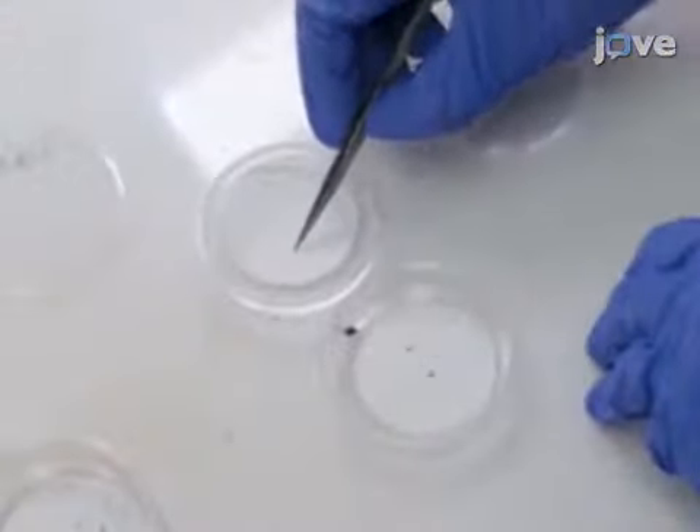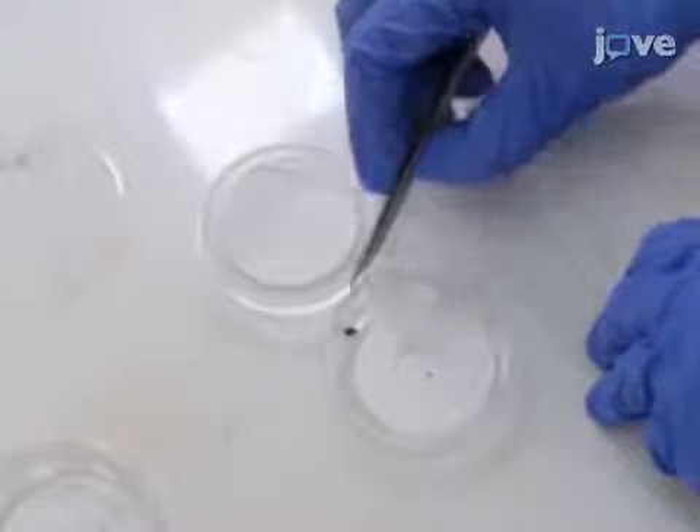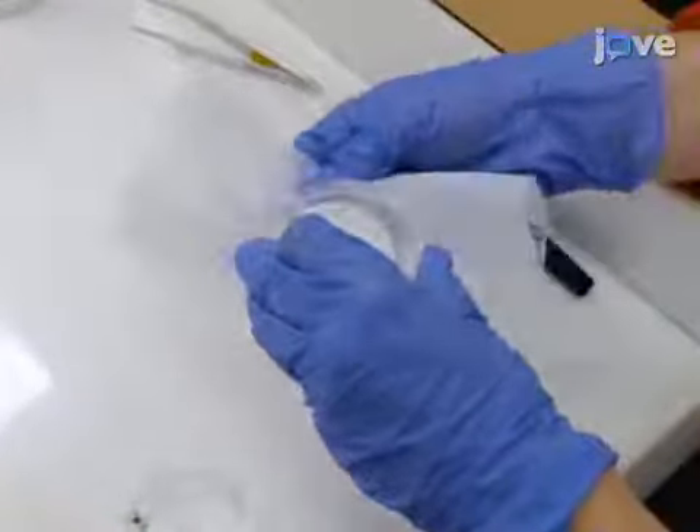Place the removed bedbug eggs into their respective groups inside the plastic petri dishes. Rub the bottom of each petri dish on the outside with a fabric softener sheet to limit static electricity from flinging bedbug eggs.